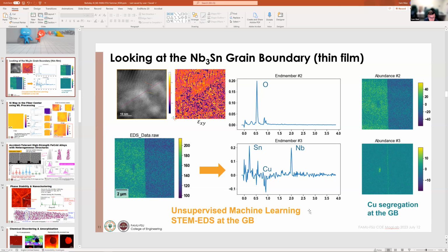I mean, our EDS is not like the recent four-detector EDS. The efficiency is not a little bit lower, actually, maybe only a quarter of these days' high-efficiency detectors, but we'll still be able to reveal these features. So some institutions might be interested in using this, rather than waiting a very long time to get a lot of data.